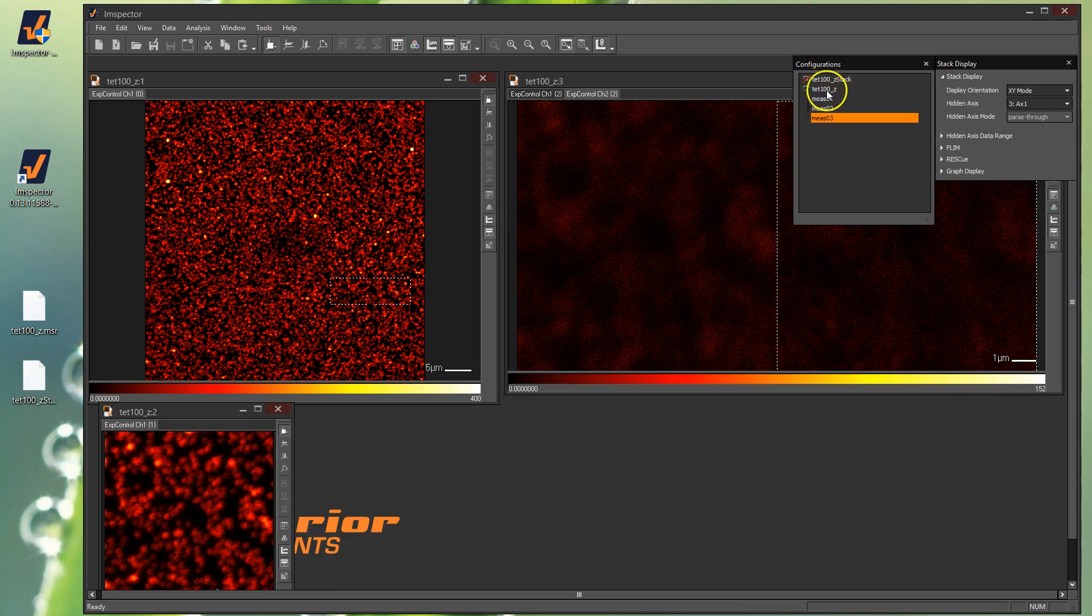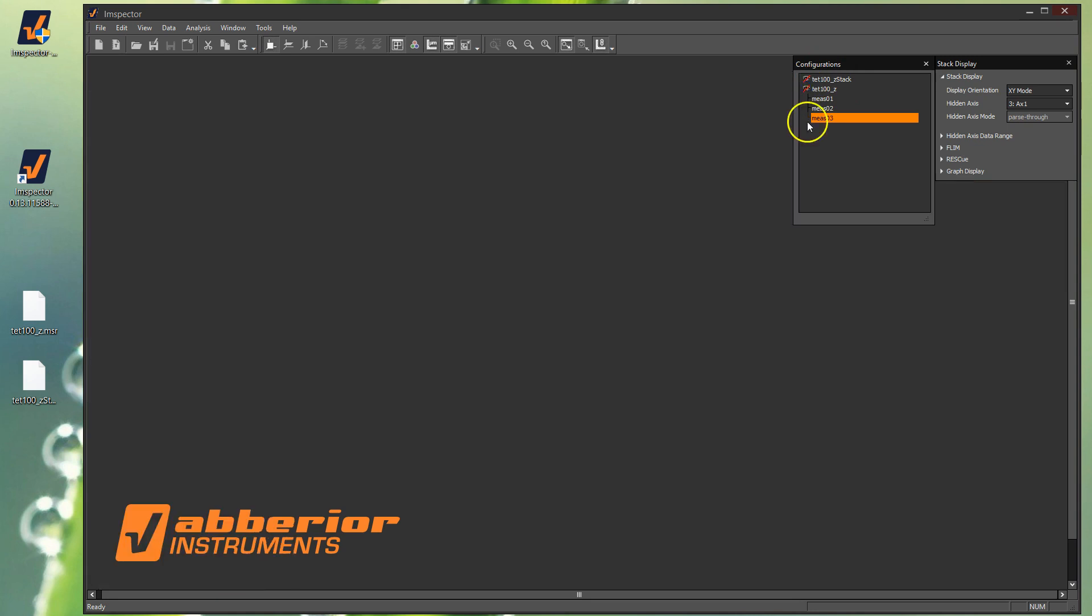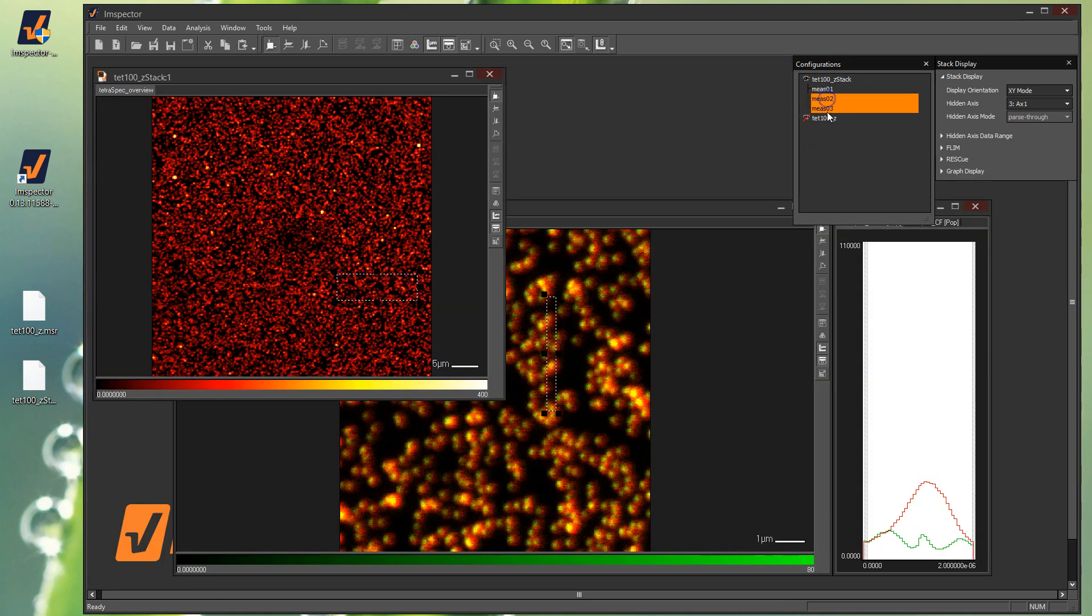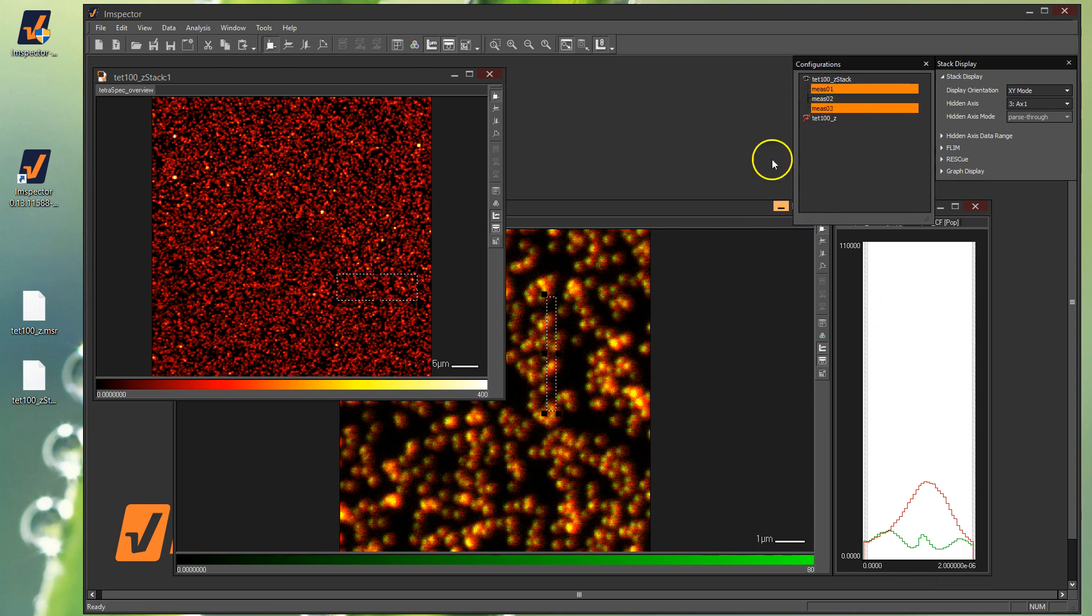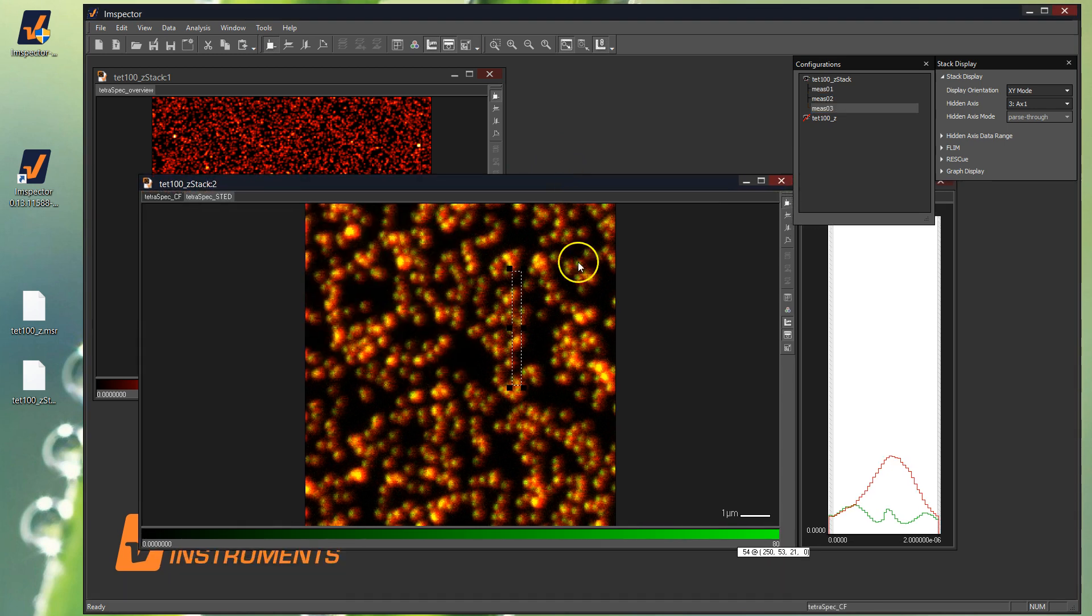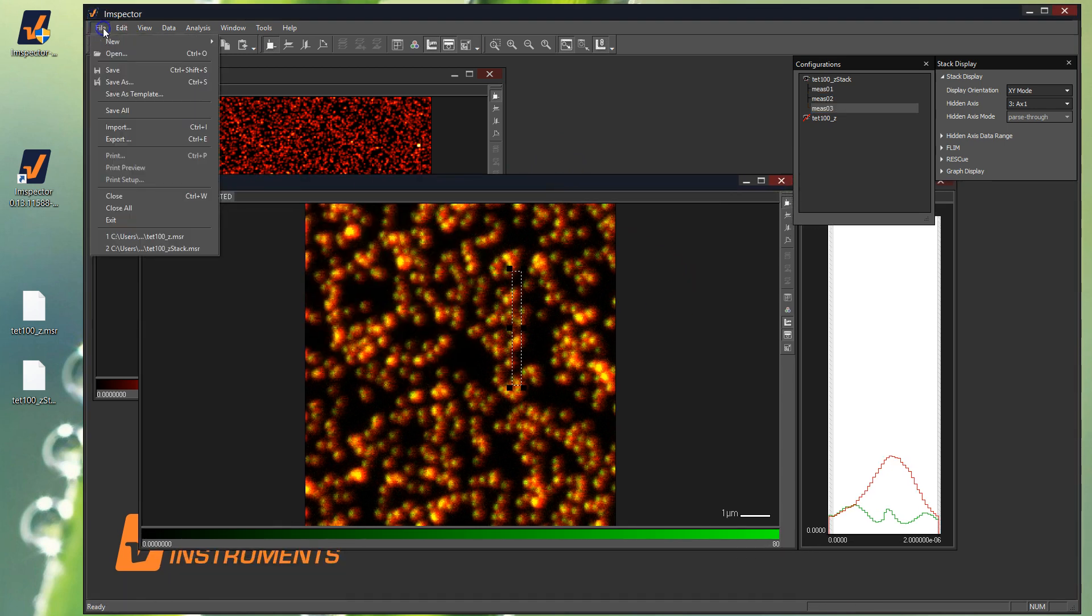And the good thing is you can turn them on and off bit by bit. I'll turn that one off. I can just inspect this one. It's essentially the same data, but I've kind of cleaned up one of them. I can turn that one off and turn this one on and click on to see which ones I've got happening. So you can kind of organize and just see the ones you want to see in that regard. And whichever window you've got open, you can use that to then export things from there.